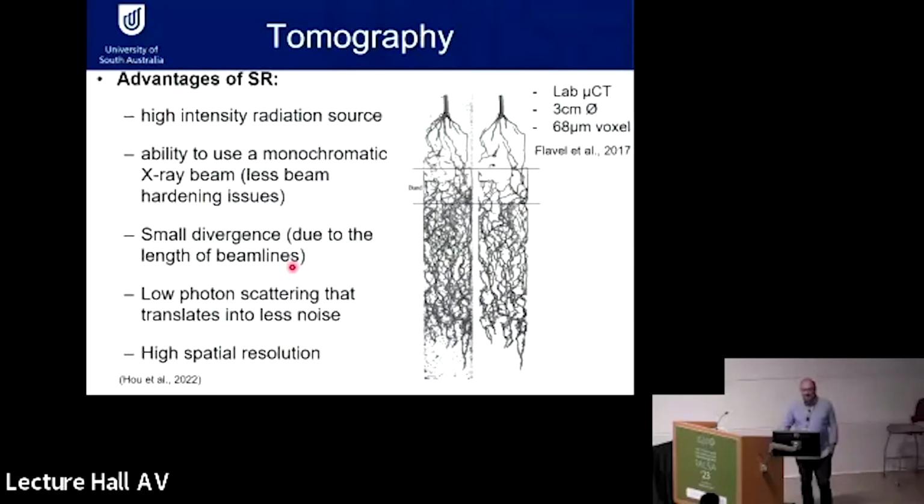Tomography of live plants in a decent size soil core, especially taken from the field, which is inhomogeneous, is really hard to do. And most of the studies are done actually on laboratory systems. But, of course, at the synchrotron, we have a better source of light.